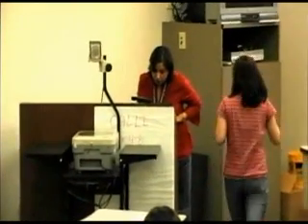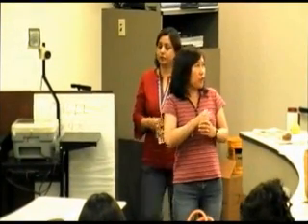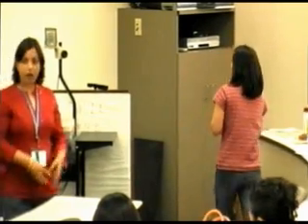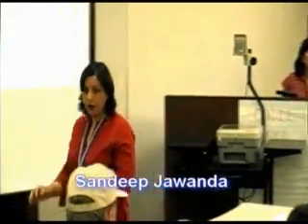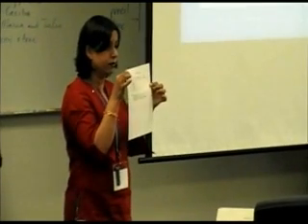And then we're going to do another activity where you will observe more changes in color, and more things related to acids and bases. All of you have the reaction plates and you have the different chemicals in there. And also you have this chart, the acids and bases. This is where you're going to record your results.